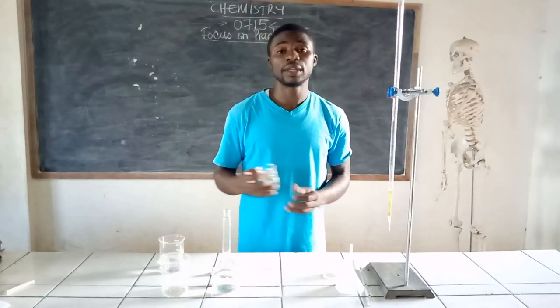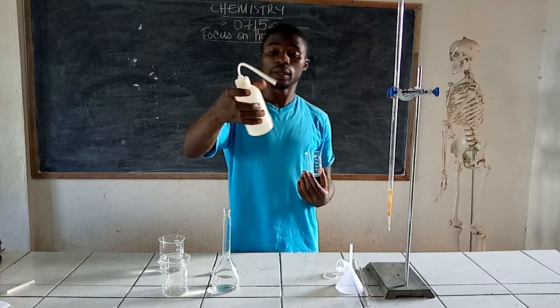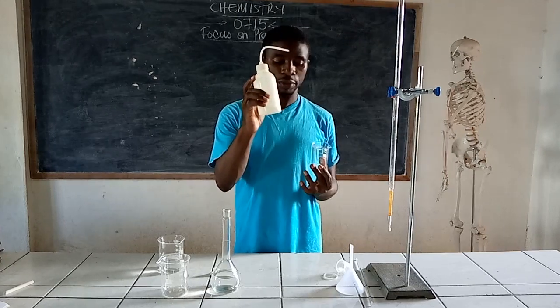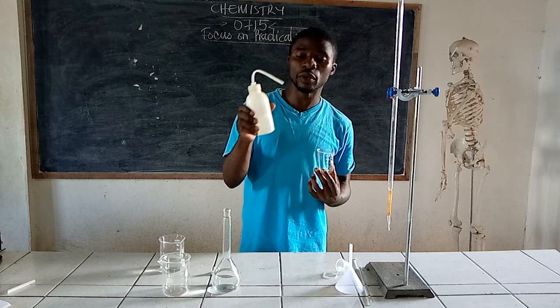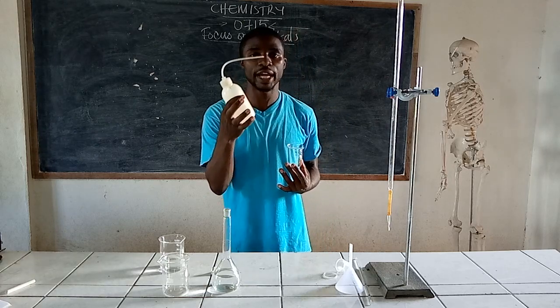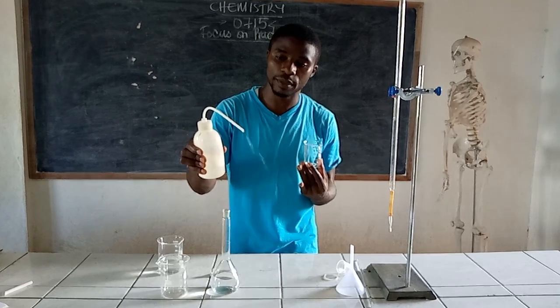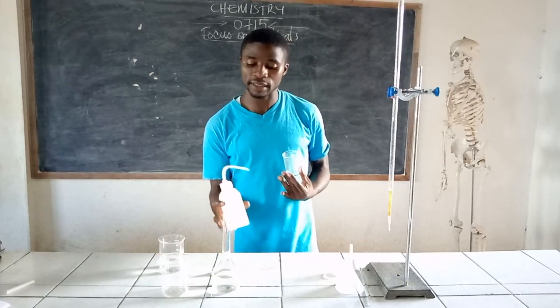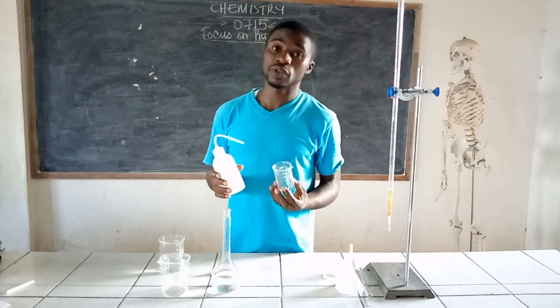One thing that most labs do is use what we call a wash bottle, but I would not recommend using the wash bottle. The reason is that the wash bottle most of the time does not deliver drops of water as required — it instead delivers jets of water. For instance, if I want to add a drop, I instead add a jet, and I can easily exceed the mark on my volumetric flask, which will prevent me from having a good standard solution.